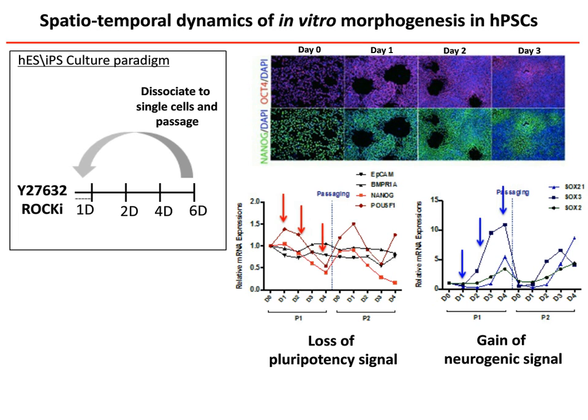So if we look on the left, in the OCT4 NANOG plot, levels get to a low point. After passage, they elevate up to the same baseline levels and then drop again in a cyclic pattern. Similarly with the proneurogenic factors. So what this indicates is that although these cells have begun to show lineage priming towards the neural lineage, they can be reset to a primitive state simply by passage.